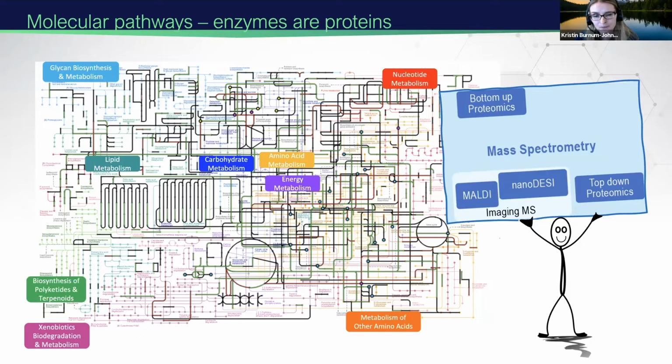So multiple design, build, test, and learn cycles and bottom-up proteomic approaches provide detailed views into how these pathways respond. So really, for our analyses, it's bottom-up proteomics for the win, by having the ability to capture this information.